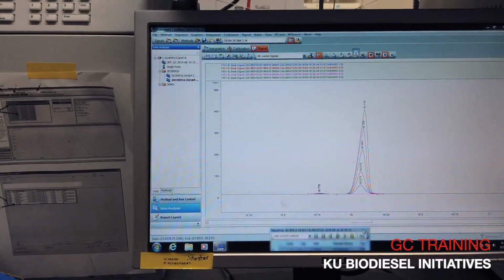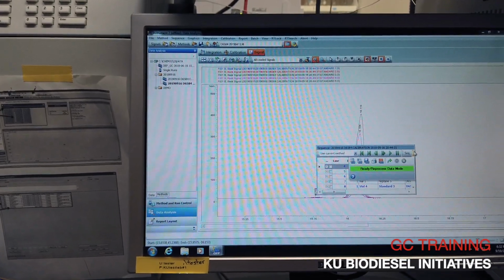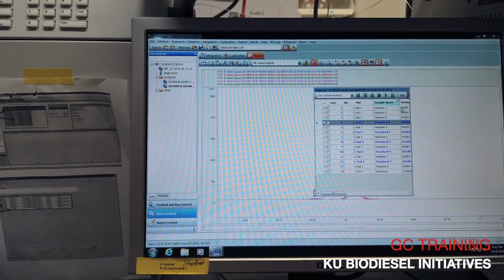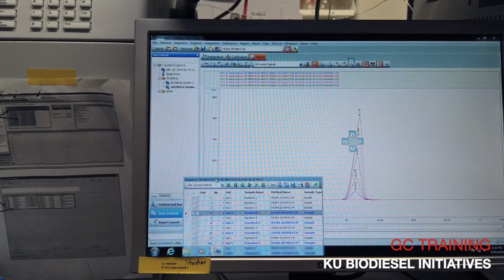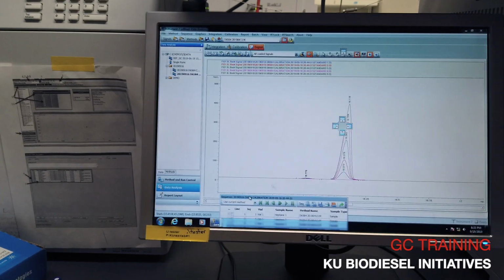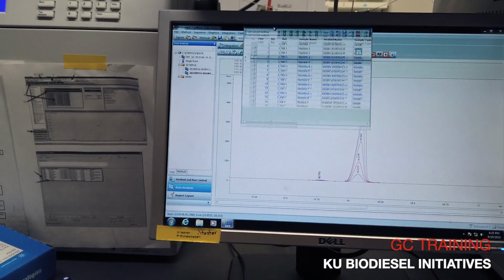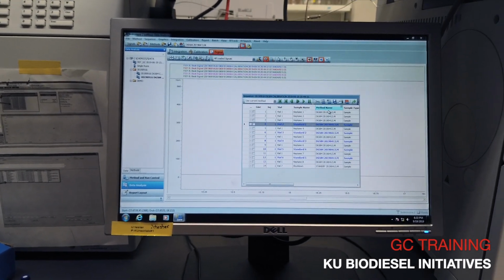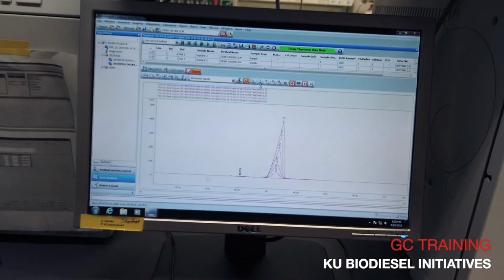Oh, I see. Interesting. I get to learn something too today then, because I've literally never had that happen before. I don't know if you should be recording this. That's our monos.